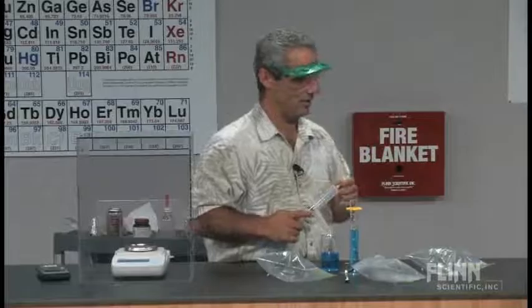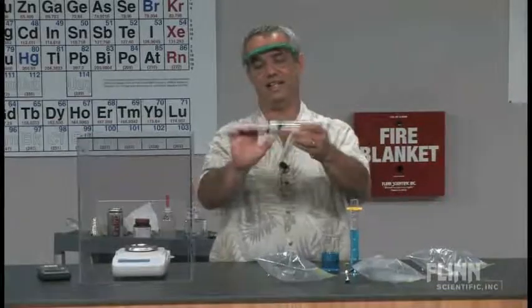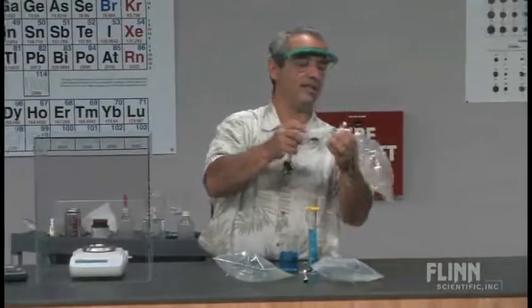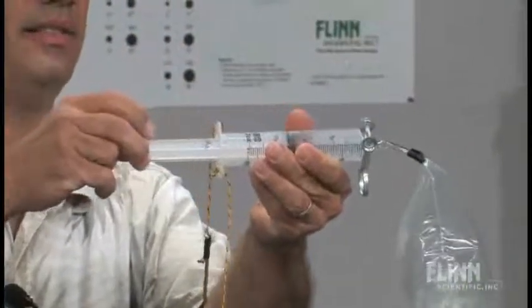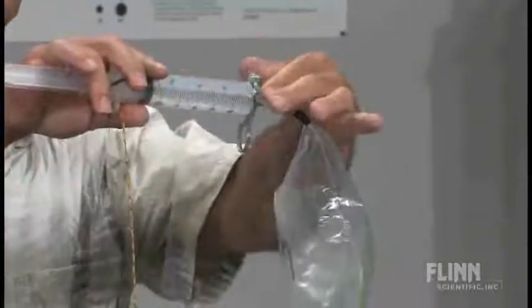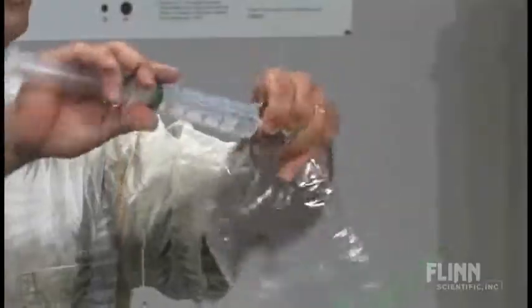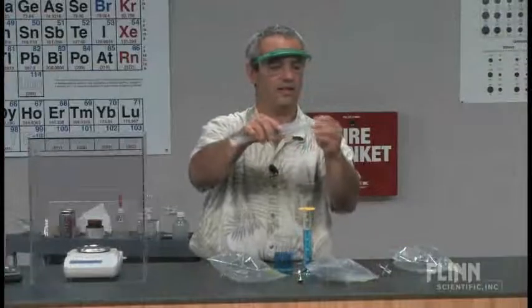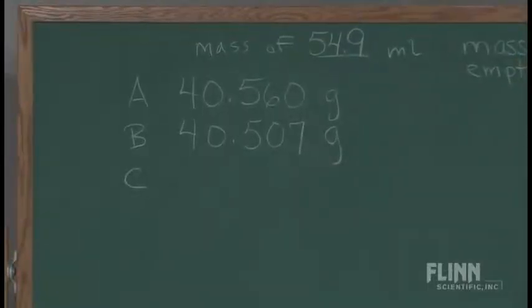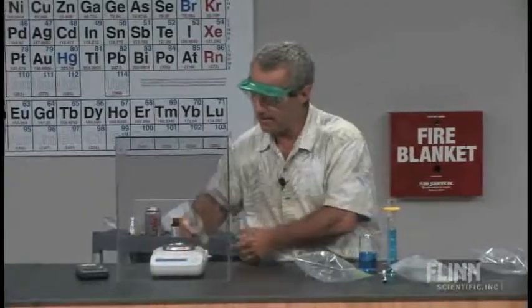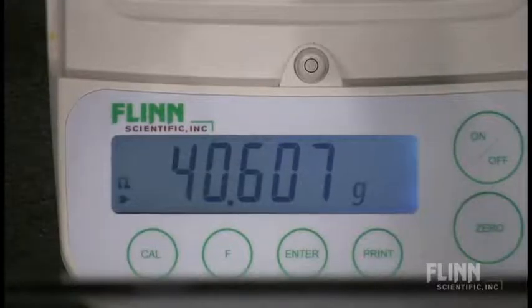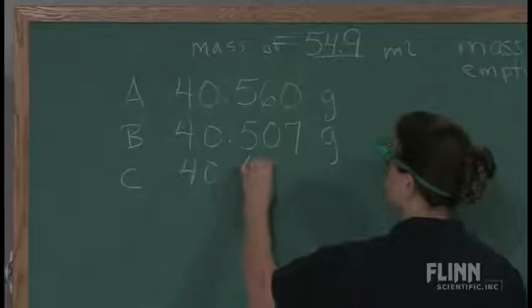So we have to do C now. Just push that out into the air. Connect it to C. We'll move the pinch clamp to there. Draw it out. Nail in there. Push it back. Pinch clamp. Nice little technique. So we can make a prediction maybe here. Let's zero this each time just to be consistent. And now this is syringe and gas sample C: 40.606 grams.